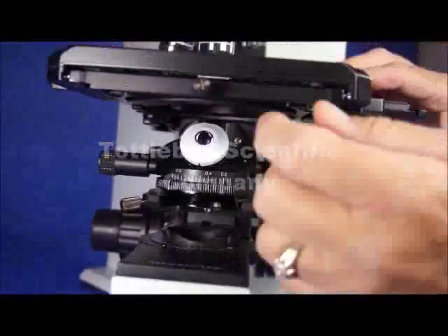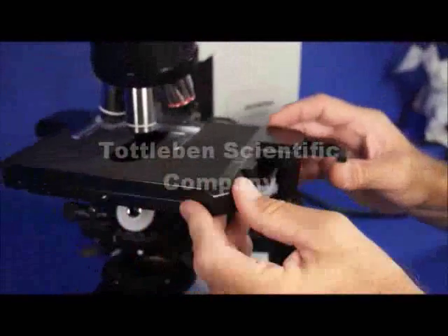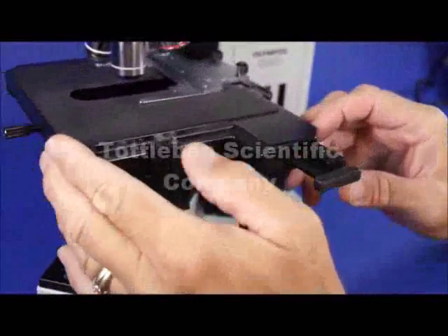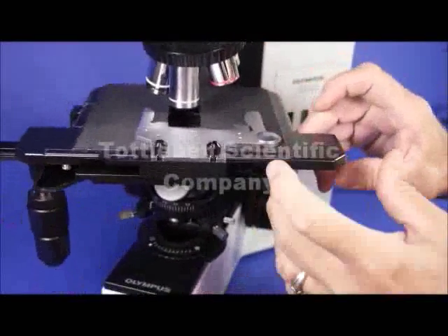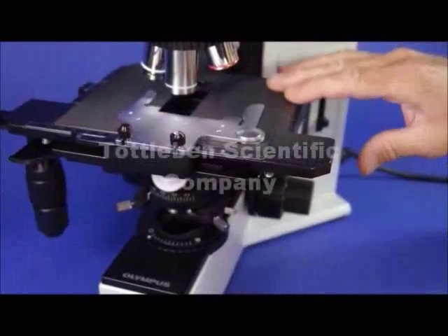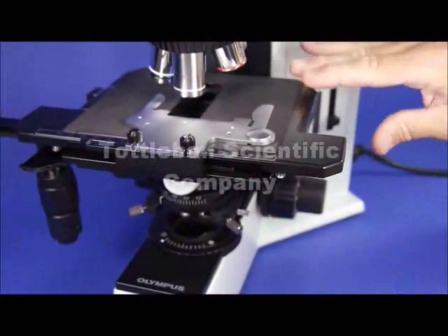This is a revolving stage. You can loosen this stage and rotate it. It doesn't rotate 360, but it rotates 270. You can rotate it all the way around, and what's great about that is you can orient your specimen to your camera plane if you wanted to equip this with a trinocular and a camera.